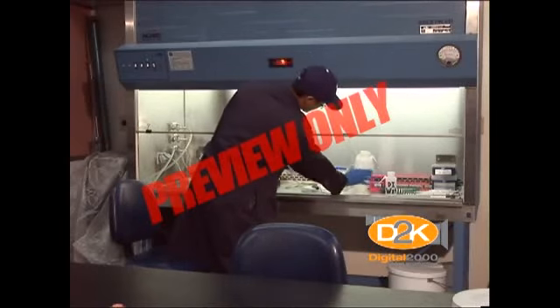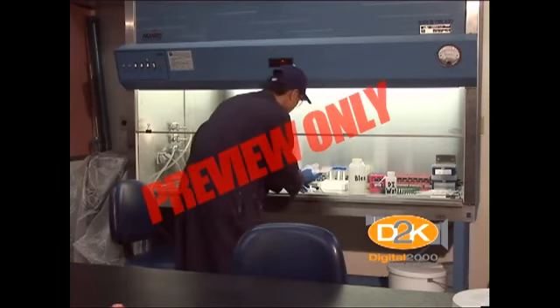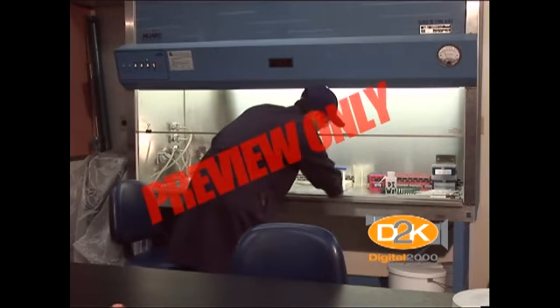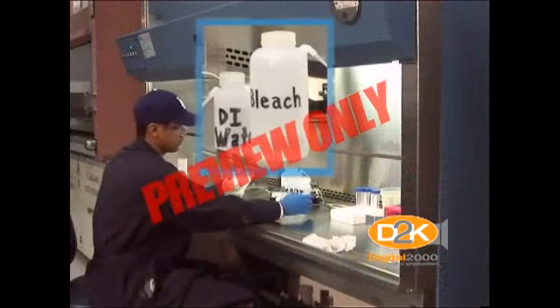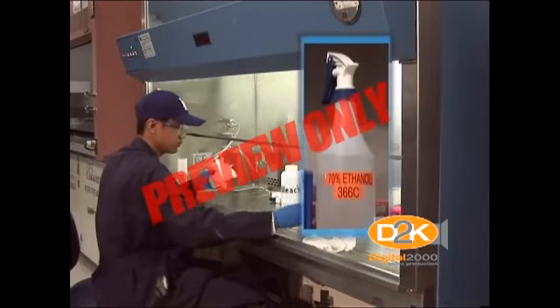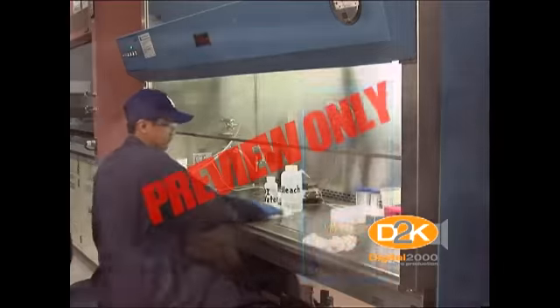Sodium hypochlorite is a strong oxidizing agent and therefore can be corrosive to metal. Diluted bleach solutions can only be used on the stainless steel surfaces of biosafety cabinets if it is immediately rinsed thoroughly with deionized water. Typically, a 70% alcohol solution is sufficient to disinfect these surfaces.